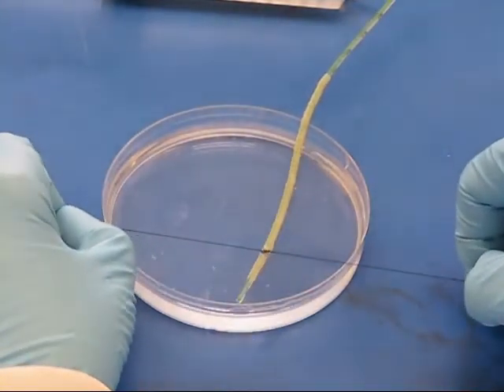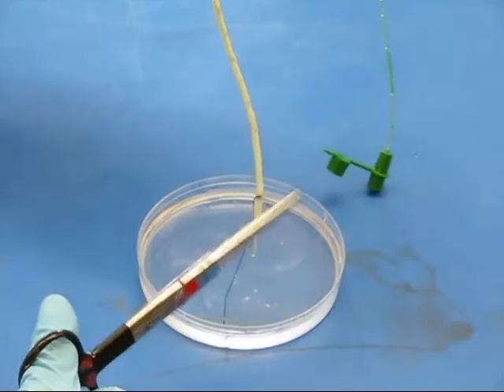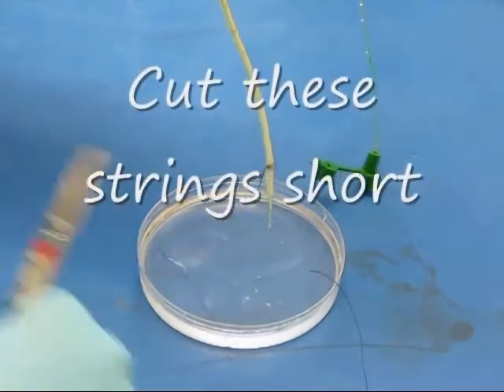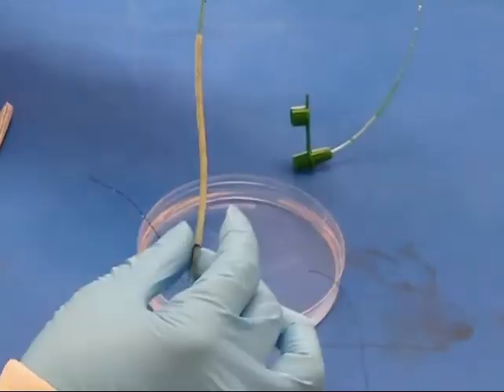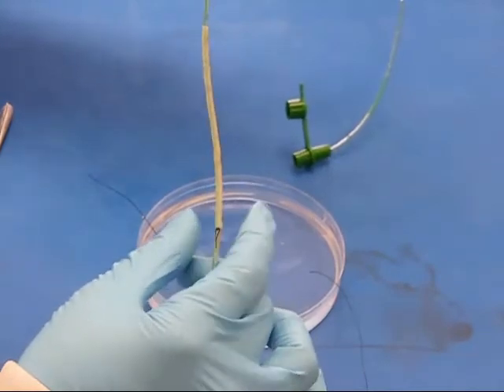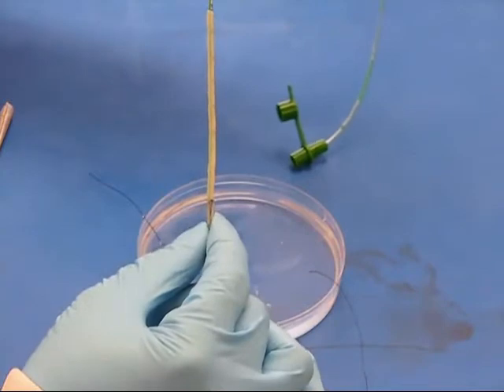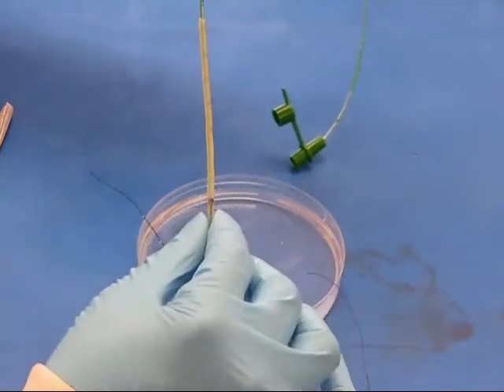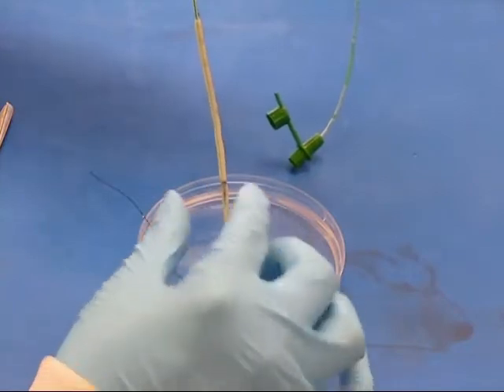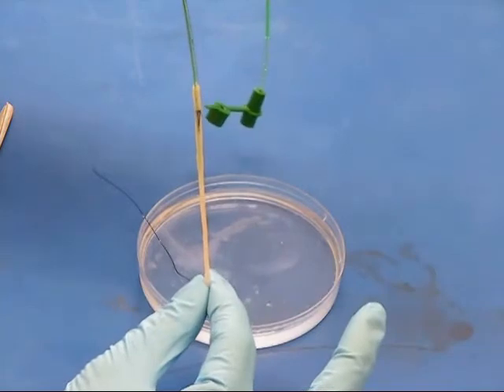The goal here is to make sure that the two holes at the bottom of the feeding tube are inside the intestine once you have turned it inside out. Next you will use your thumb and forefinger to gently slip the intestine over itself. Gently grasp the intestine just above the knot, slide it down over the knot and release. Repeat this procedure until the entire intestine is turned inside out but remains attached to the end of the feeding tube.